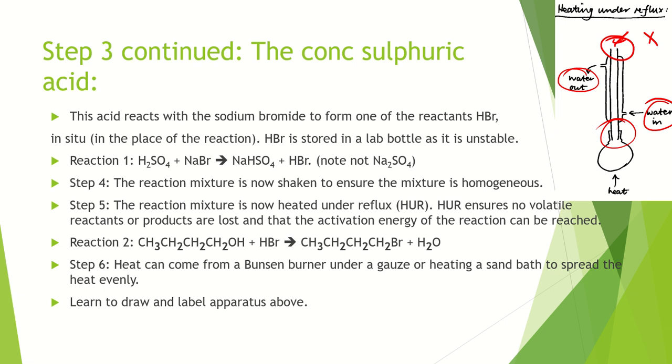Right, next thing then, we can just heat it and we can put our anti-bump granules in it, but that also creates a possibility of some parts of it getting hotter than others. So if you really had an experiment where you wanted to spread the heat, you can do a few things actually. You can put it inside a beaker of water and use that to heat it. You would heat the water from below. Now that only works if your reactants and products are able to boil at less than 100 degrees.